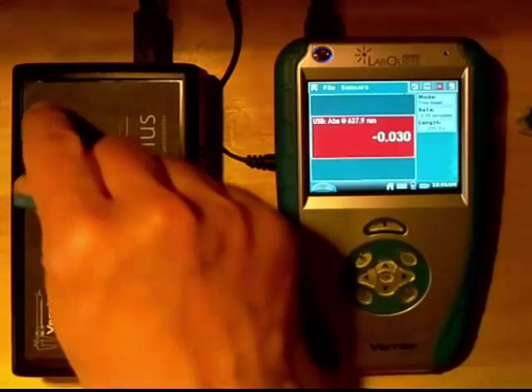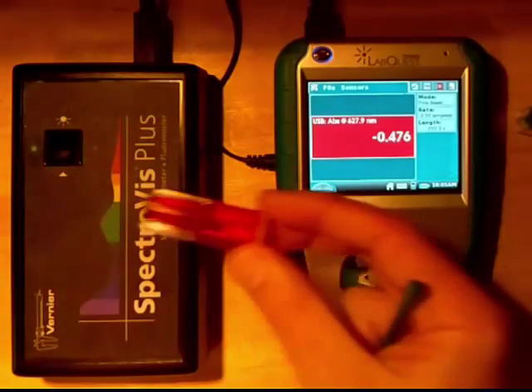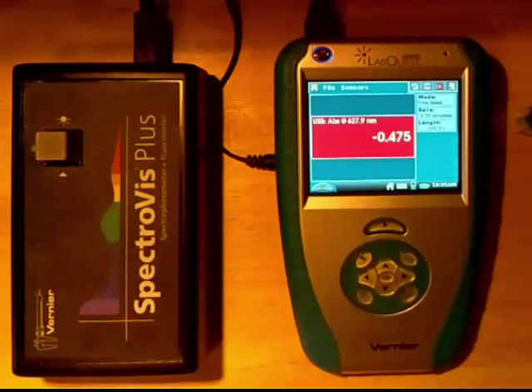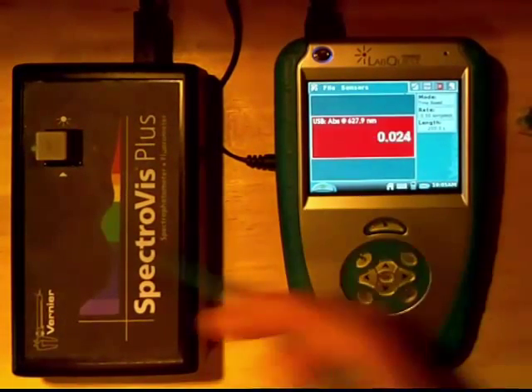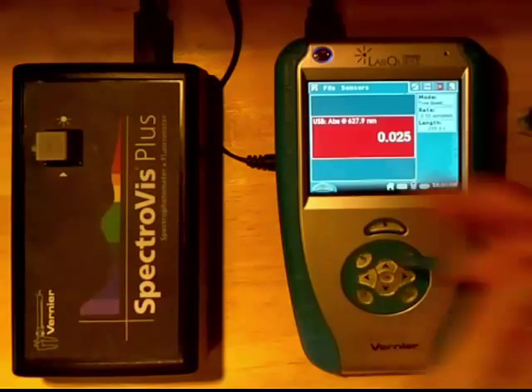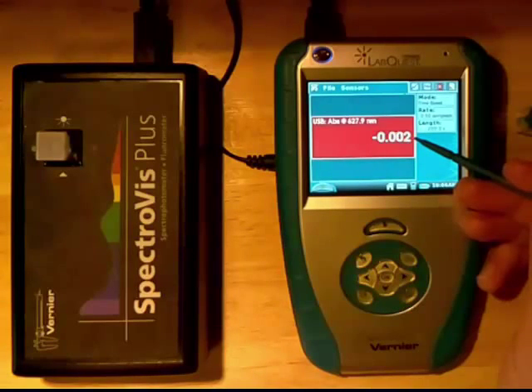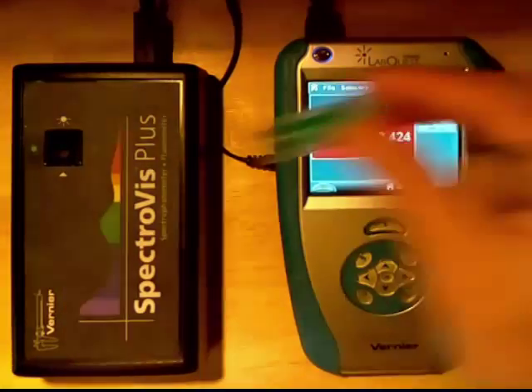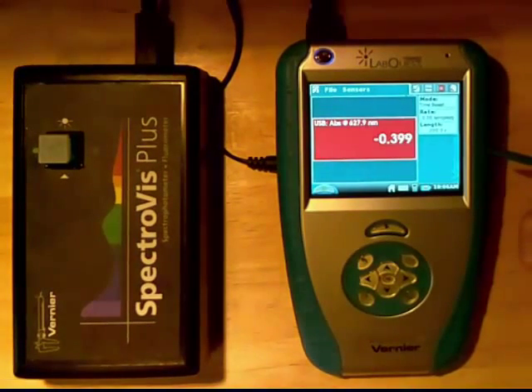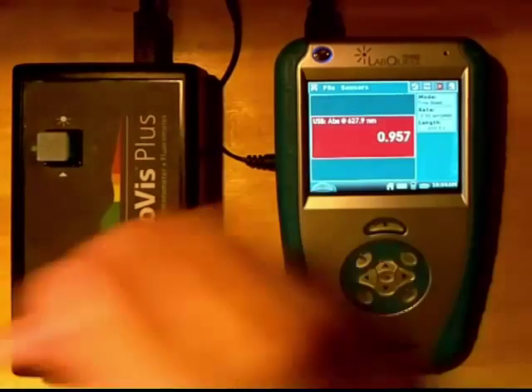I can also take out the calibration solution and put in the red solution — does red absorb at the same wavelength as the green? We see that the red has very little absorbance, different from the background but very negligible — about 0.024. In this case the background is around 0.002, very close to zero. The green is 0.958, so the green is fairly strongly absorbing in this region as opposed to the other two.